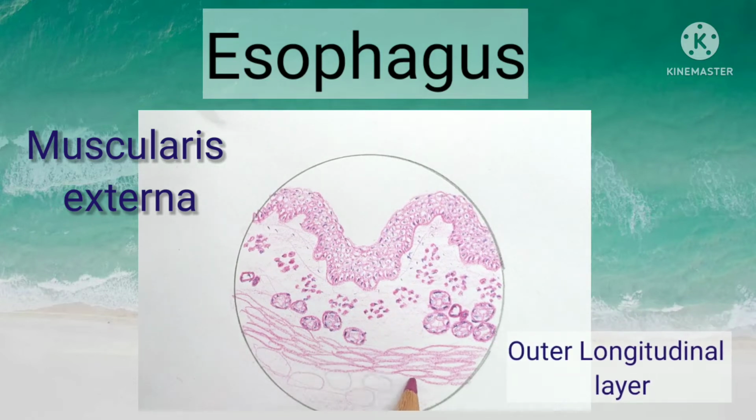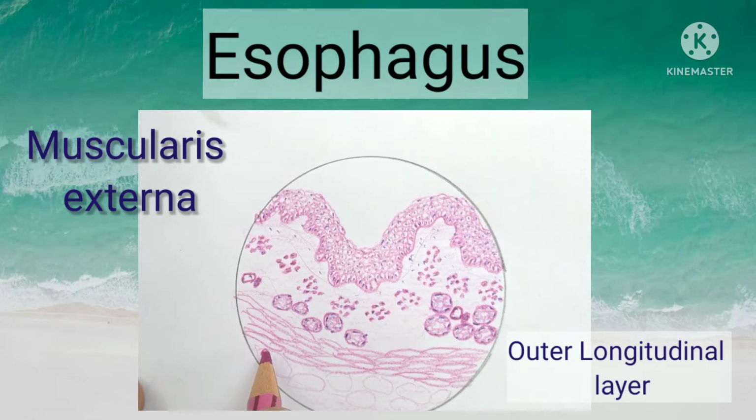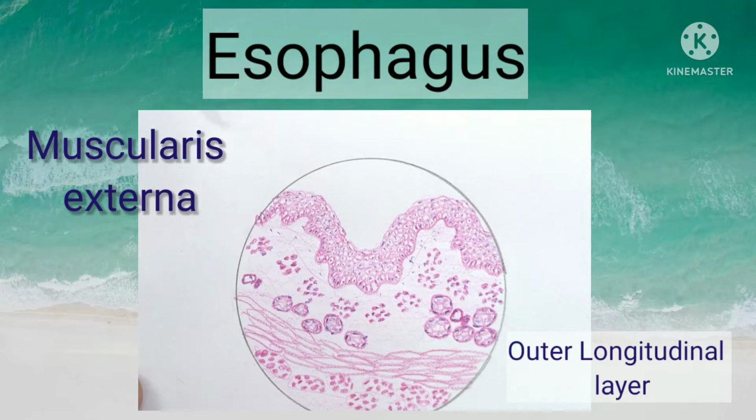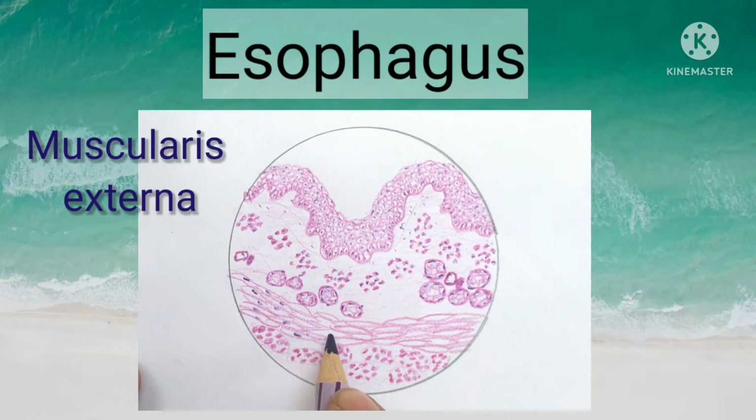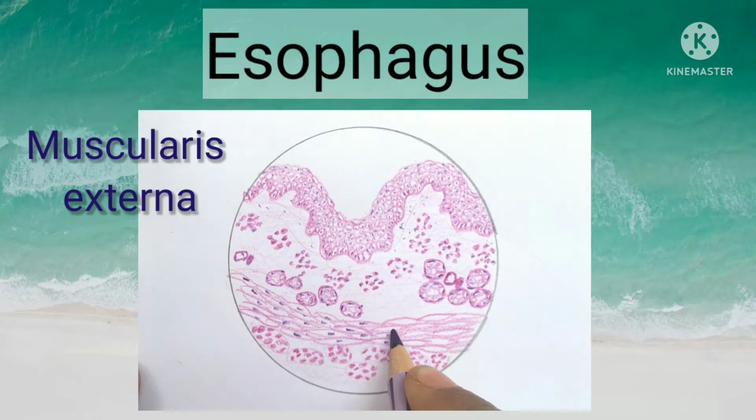Make sure when you're writing the muscularis externa, the number of layers should be more compared to the muscularis mucosae. Muscularis mucosae is a very thin layer of muscle, whereas the externa is a very thick layer and very helpful in peristalsis. So the inner circular layer has flat smooth muscles with tapering ends and flat nucleus. The outer bundles of longitudinal muscles have sections varying in size, and the nucleus in the center, a round nucleus. You need not keep nucleus for all in longitudinal bundles.